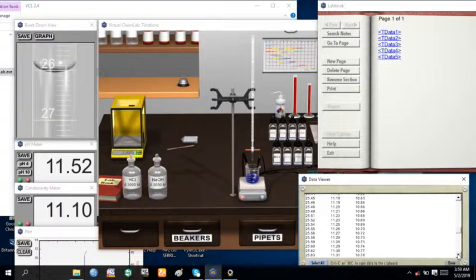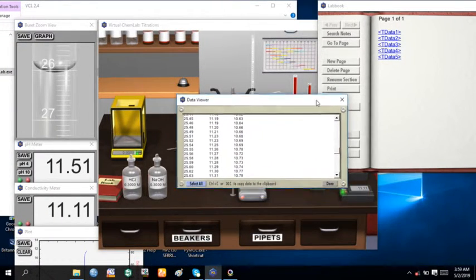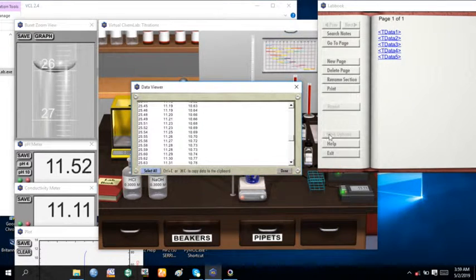So these are some of the results we obtained. You can calculate the average volume of the data, send it to a spreadsheet for analysis. So we can repeat several experiments on this acid-base titration until we get the accurate endpoint. These are some of the results we obtained. So this is one of the experiments.